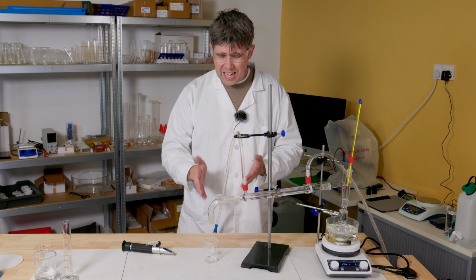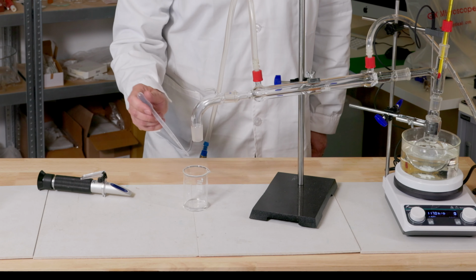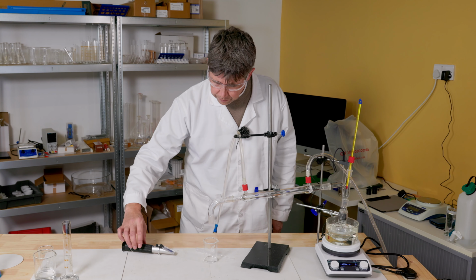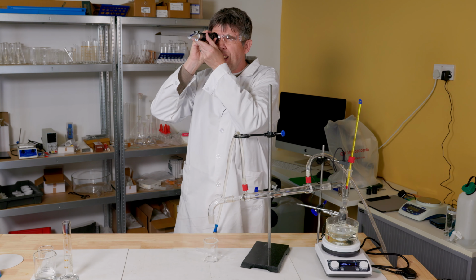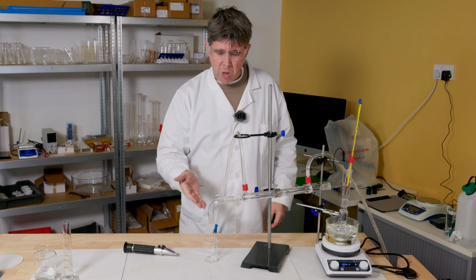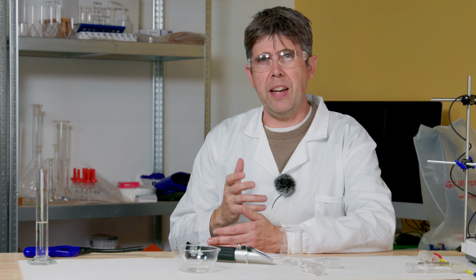Before I do that, I'm going to test this sample for purity, and I've got my alcohol refractometer here. If I take a couple of drips of this distillate, place it on my screen, close my little window here, and then look through this, it will tell me the percentage by volume of ethanol in this solution. So I guess the question we've got to ask ourselves now is, is this pure? Well, my refractometer tells me that it's only 75% ethanol.